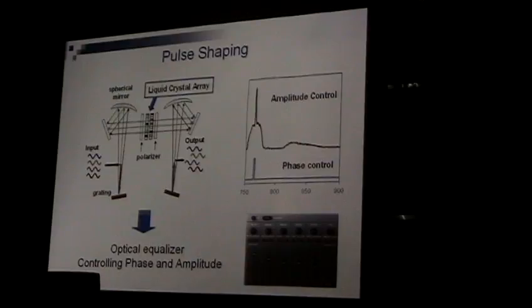And you have a very similar device, I guarantee. Everybody in this room has a very similar thing at home. It is called a sound equalizer. If you look at your boombox carefully, you see this kind of thing, or even on your MP3 device. There is one page called preset or something. You probably remember something like this. There were lots of vertical sliders, labeled something like 100 hertz, 1 kilohertz, 2 kilohertz. This is called a sound equalizer. What it does is basically control the amplitude of these different frequency bands, so it makes the sound comfortable for you.